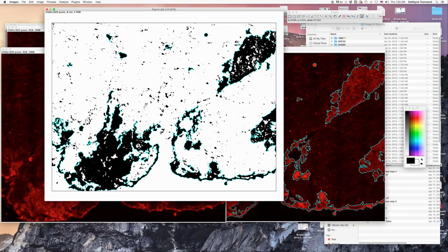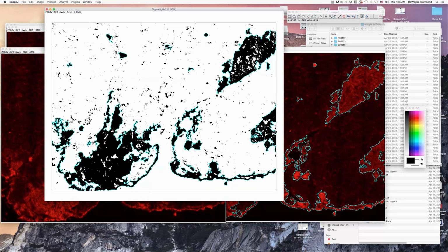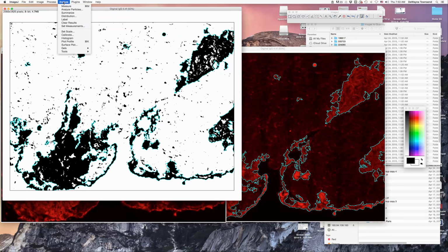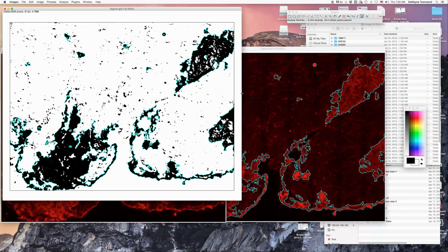One thing you'll notice is that it took this area off the center, but when we look at our regular image, it's probably right in the middle of the lesion. So I'd be very tempted to just include that, basically drawing along the side. So now it will recognize this image all as one. If we take this image and rerun our Analyze Particles, now you can see this is all one pretty big area, number 13 here.